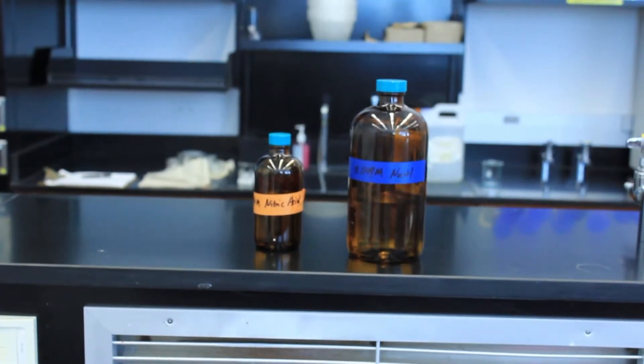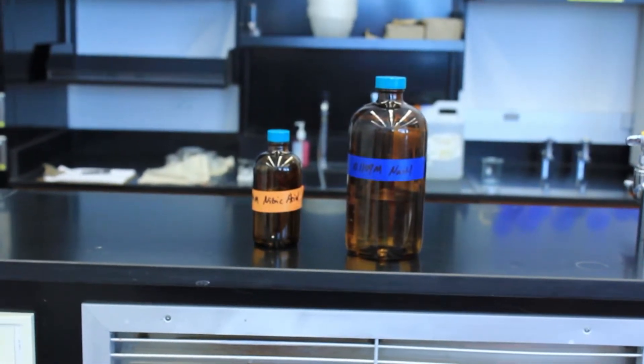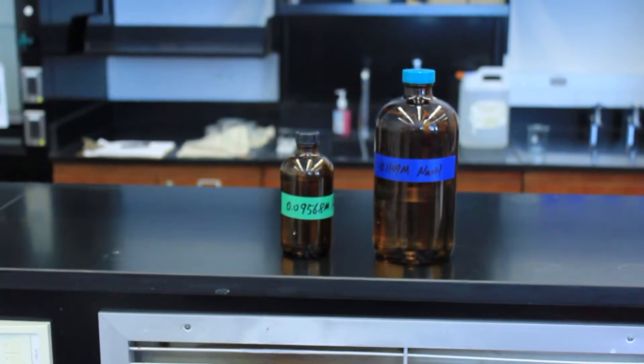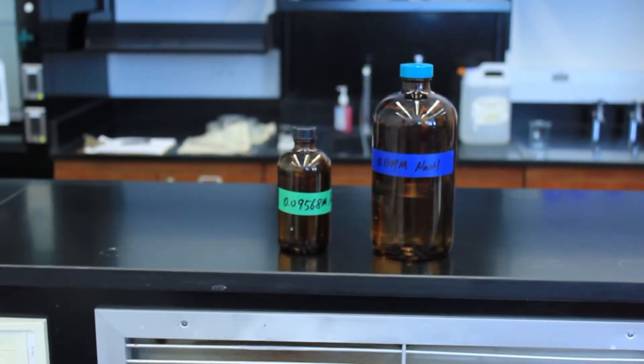For part one of the experiment, use nitric acid and sodium hydroxide. For part two of this experiment, you'll be using formic acid and sodium hydroxide.